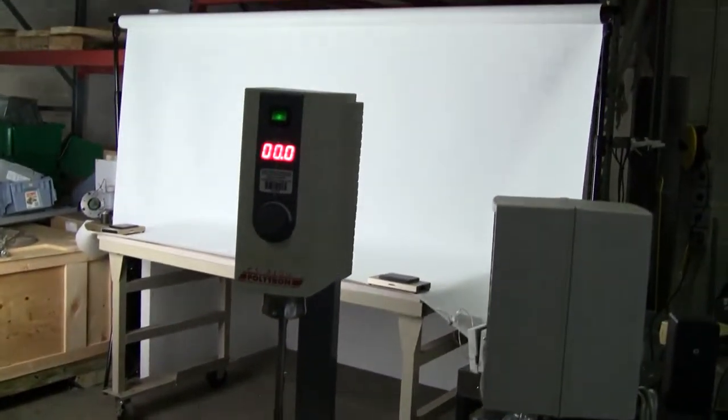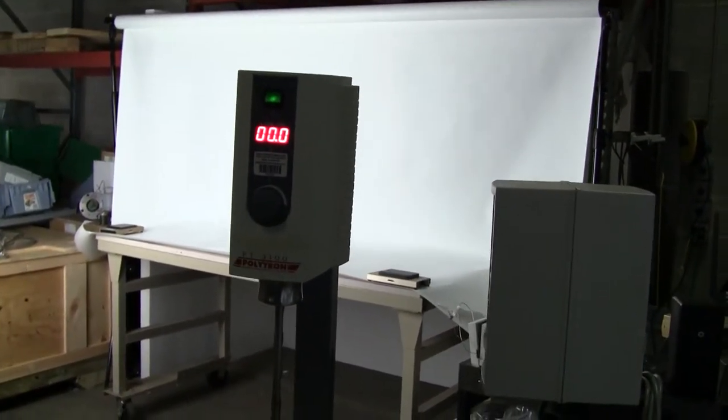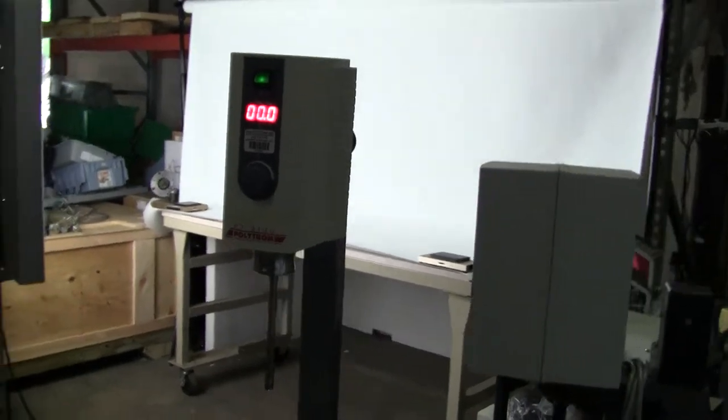Hi, this is Jim High Tech Trader. Today we're looking at a Kinematica Polytron PT3100 homogenizer.